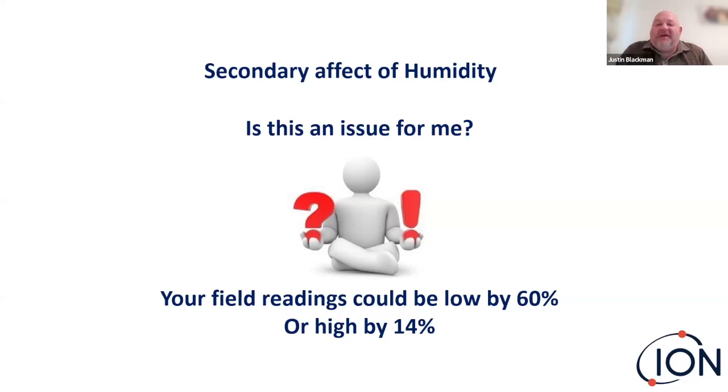The best way would be to think about taking some readings, sacrifice the life of a water bottle. Consider doing that test yourself, okay? Information is power. We can then deal with it, choose a different instrument, or maybe make a correction for those readings in our data.